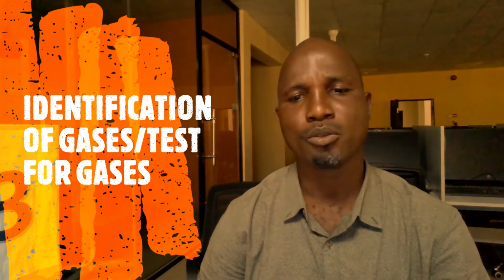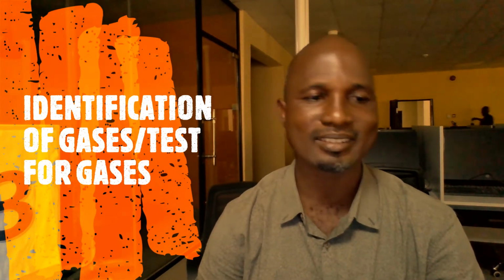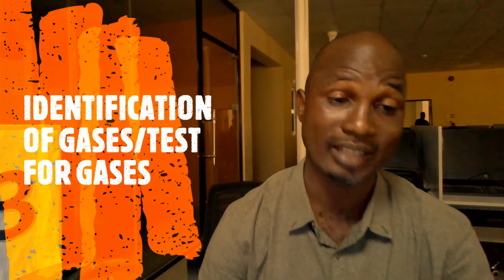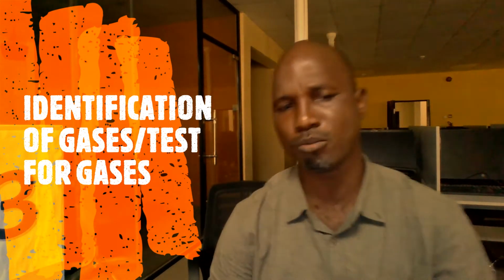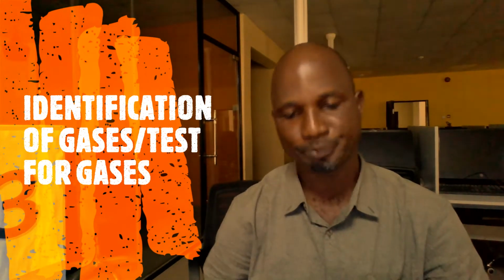We have your carbon 4 oxide CO2, you have your nitrogen 4 oxide NO2, you have your hydrogen gas H2, your oxygen gas O2, your HCl, which is hydrogen chloride gas, we have your ammonia gas NH3, we have your bromine gas, iodine, chlorine, hydrogen, just to mention but a few. Today we'll be looking at them and how you can identify them, confirm them in the laboratory.